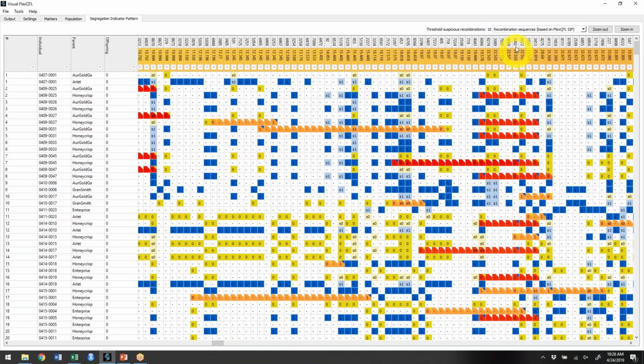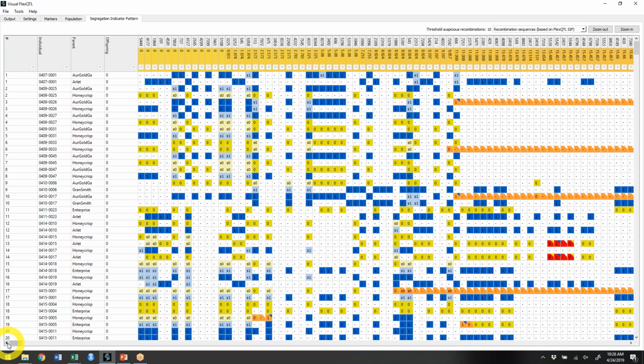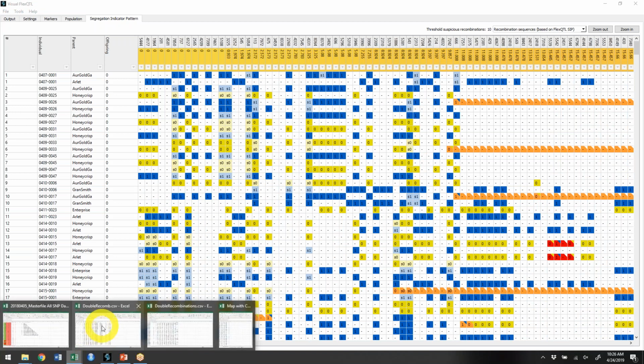And then it was marker 8002, if you recall, and you can already see that there are a lot of issues here. Well, because we know that the issue is with the clustering, I'm not going to look for other solutions right now. I first want to fix the clustering and hope that fixes everything. So let's go back to the beginning and back to our file here.